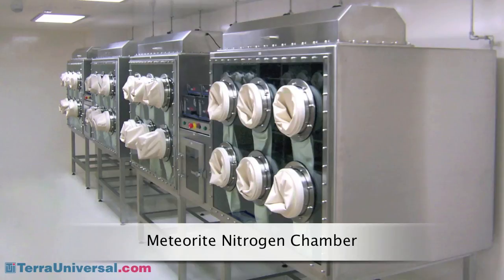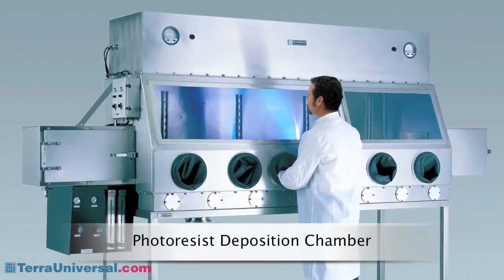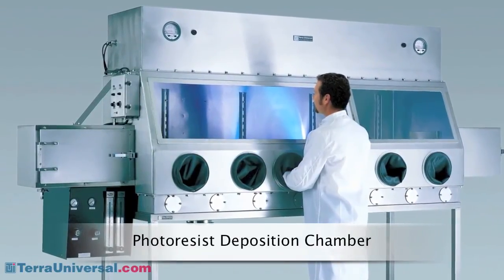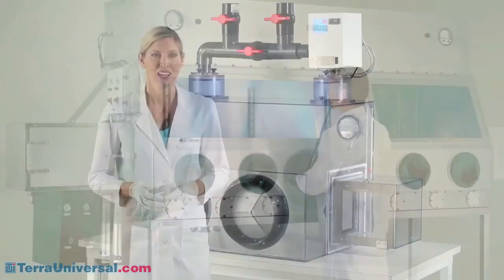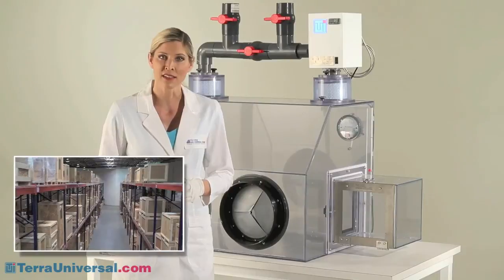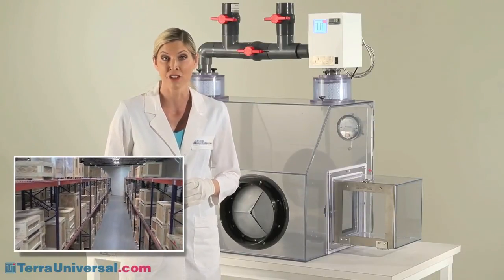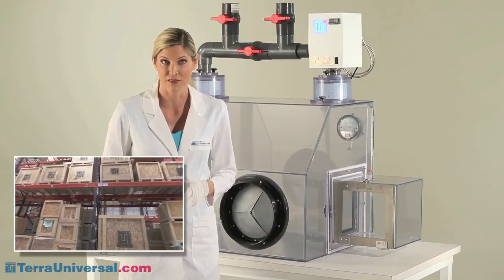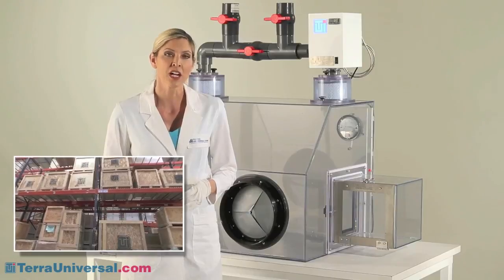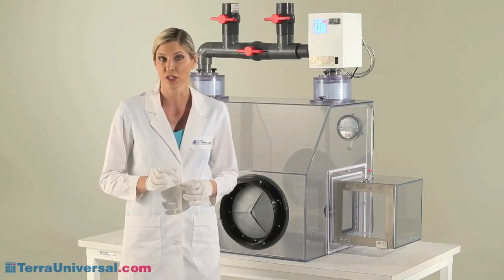Terra works with your engineers to develop a chamber tailored to your application. Our economical control modules can help you achieve unique and cost-effective environmental control in a chamber custom designed to your specifications. Terra stocks dozens of isolation glove boxes for next-day shipping at its Fullerton, California manufacturing facility. They can be purchased directly from the TerraUniversal.com website. For other models or custom requests, submit a quote card at our site, or call to explain your requirements.